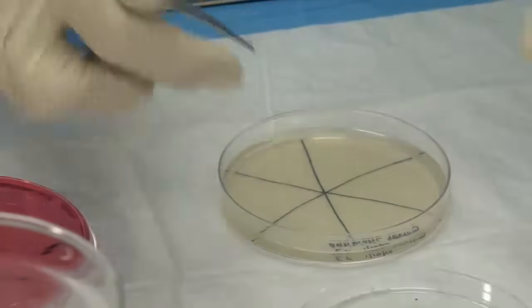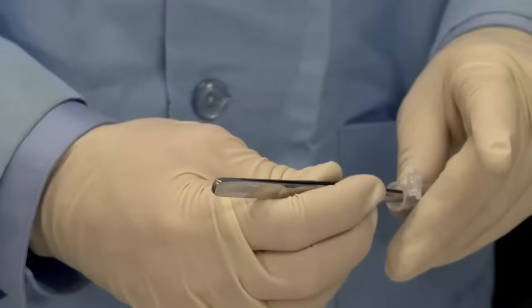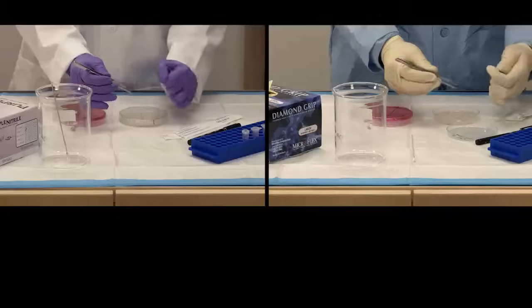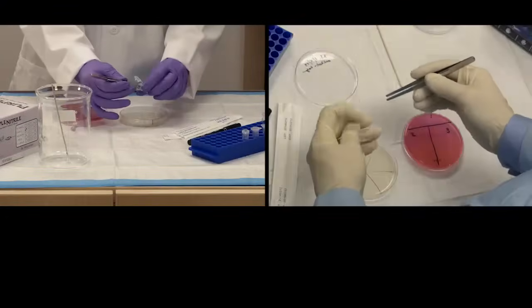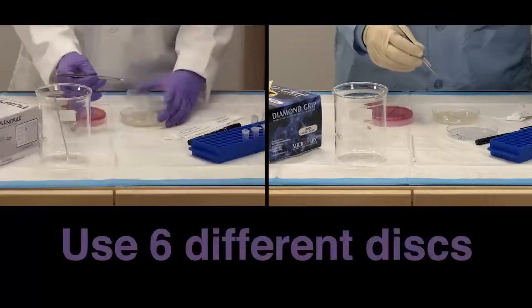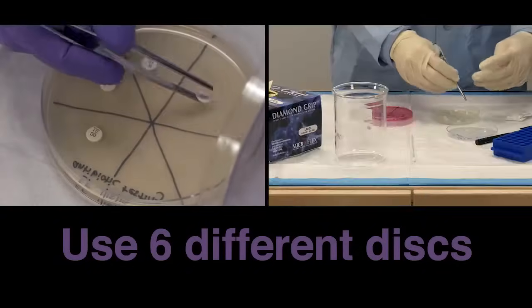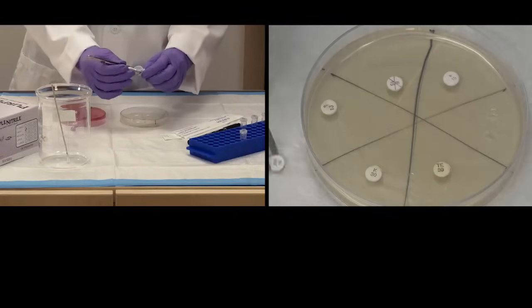When placing the discs, use the lid to shield the plate from contamination. If the disc falls out of the tweezers, leave it where it falls. Do this five more times for each of the antibiotic discs. Check the labels on the discs to make sure they are all different. We want to test how susceptible the bacteria is to each kind of antibiotic.